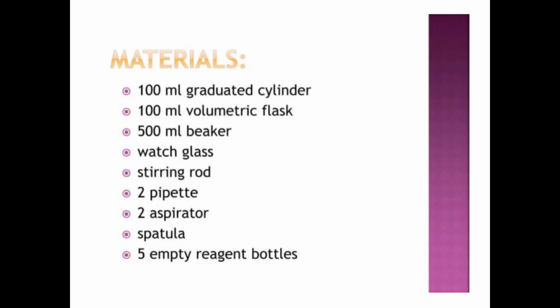You are going to need an empty reagent bottle, and the reagent bottle is generally to house the prepared standard solution.